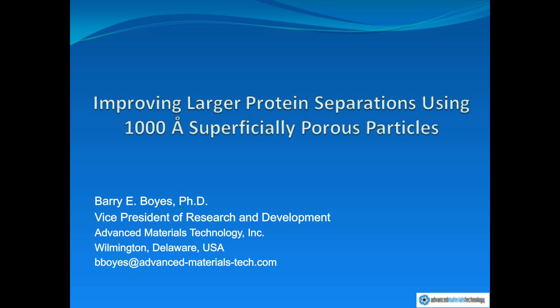Fantastic. Let's take one last very quick question. Wouldn't the smaller particle size on the 1,000 angstrom particle also elicit better resolution and efficiencies of proteins and antibodies, regardless of pore size? Nope. You need big enough pores in order to get good quality separation. For example, I showed in earlier slides an example of 160 angstrom pore size material, which was 2.7 micron, compared to a 400 angstrom 3.4 micron material.